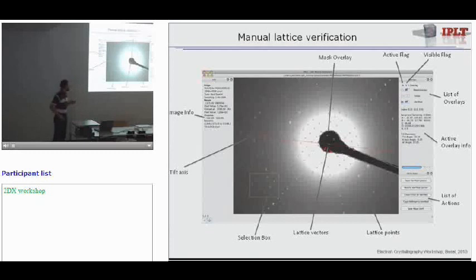So if you have missing spots, then IPT probably gets you the big lattice automatically. But in these cases you always have the chance to set it correct in the verification step.